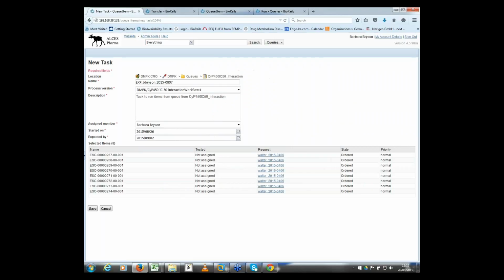And then does the volume always come from the order profile? No. So that's the most simple case. So if I just swap through here, we'll go and have a look at the actual assay queue itself. So let's go back here.